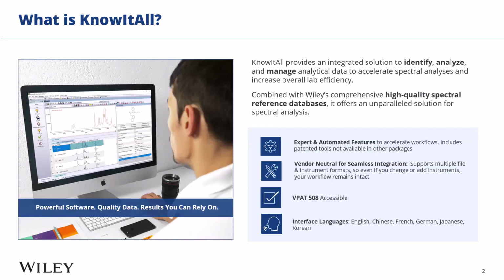And just some highlighted features is that it includes expert and automated features for your spectral analysis. It is vendor neutral. We support over 130 file formats across various techniques, meaning that if you are a multi-technique lab, you could bring in raw data from your other instruments into KnowItAll as well. It is VPAT 508 accessible, and it comes in a variety of languages.